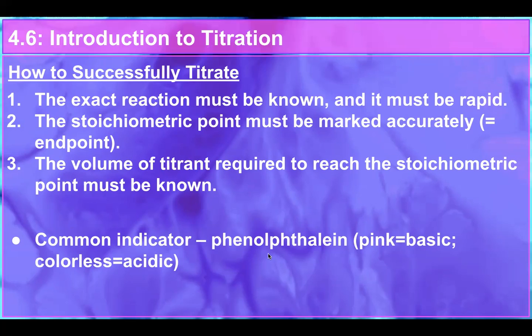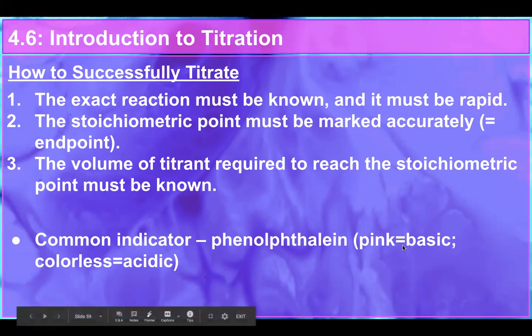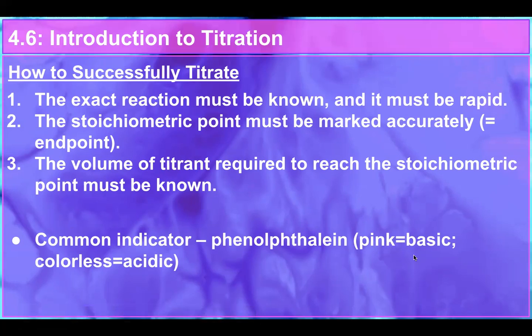So if we are using a juice or a pop as our analytes, okay, that would be acidic, so it would look colorless. But as soon as we add enough of something like sodium hydroxide, then it will turn pink as the equivalence point is reached.